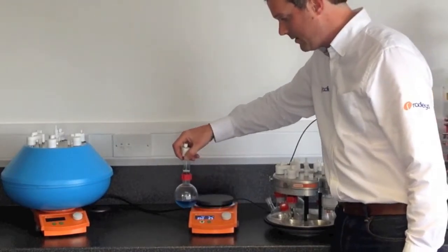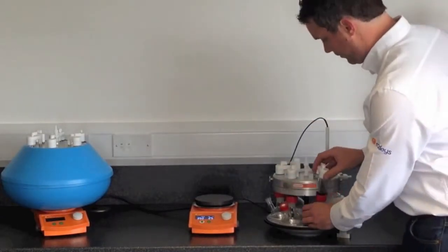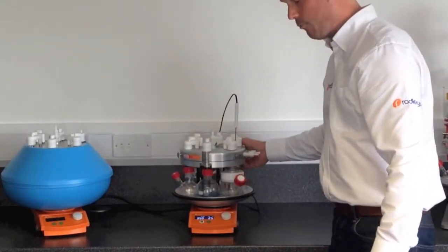So you can have 6 flasks on one hot plate as opposed to one. As you can see, they're all going to be stirring at the same speed and heated at the same rate.